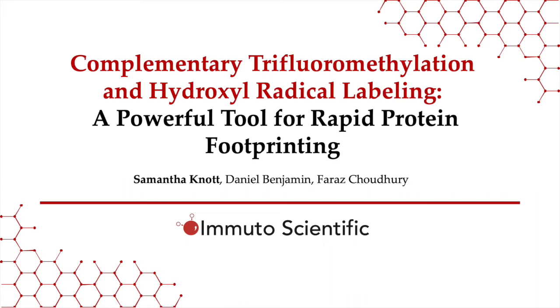And my name is Samantha Knott from Immuto Scientific, located in Madison, Wisconsin. I'd like to thank the session chair and the ASMS organizers for giving us the opportunity to demonstrate and show our exciting work: complementary trifluoro and hydroxyl radical labeling, a powerful tool for rapid protein footprinting.